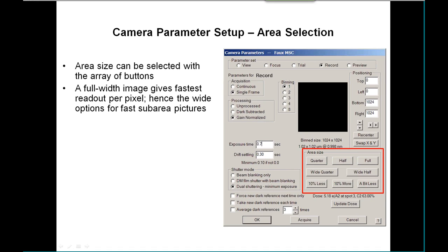The size of the area can be selected with a number of different buttons. The most popular sizes are quarter, half, and full. The rationale for wide sizes is that with a standard CCD camera, the readout time is fastest if you're reading out an entire width of image. This is the most efficient way to get fast pictures out, to use somewhat wider than square pictures.